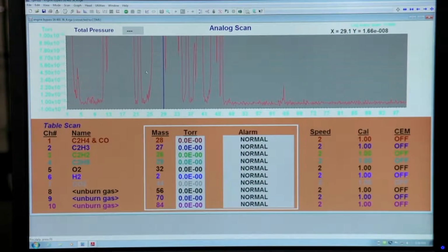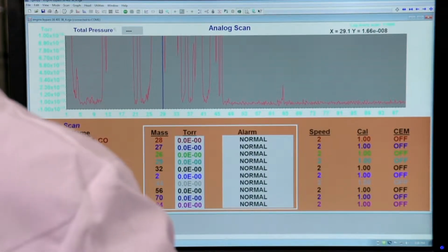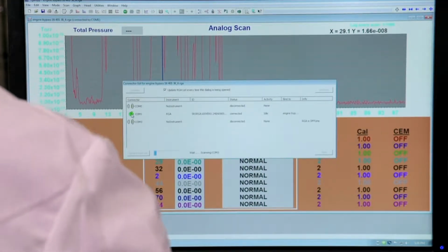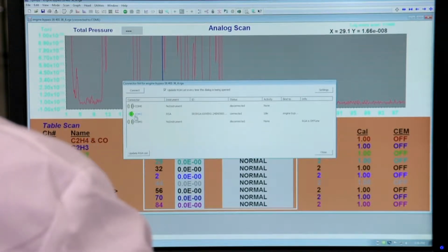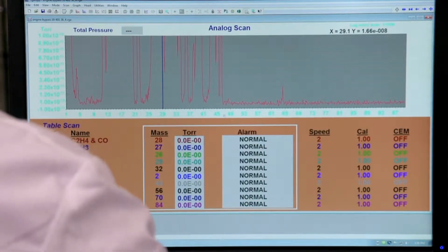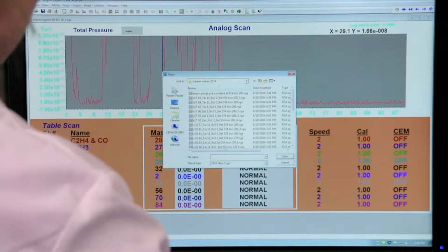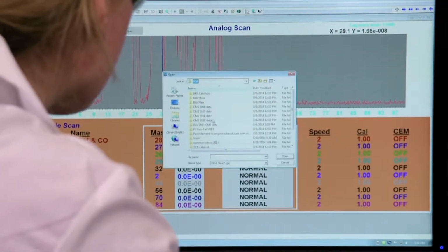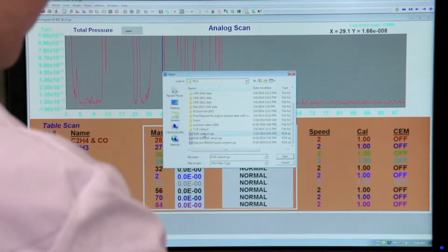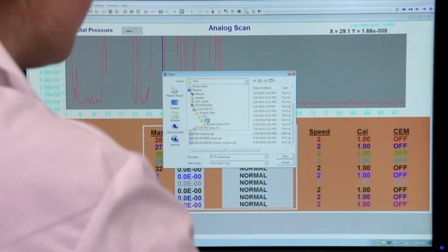To make the scans go faster, we will load a different program. So to do this, you're going to go to the menu bar and then head to Connector List Setup. You should click on the COM1 when it loads and disconnect that, and then close. And then in the menu bar, go to File, and then Open. And this time you're going to want to select 4144 catalyst.rga. And this is under Program Files, SRS, and RGA.